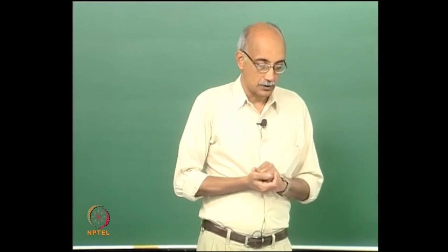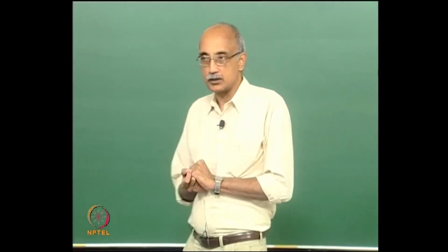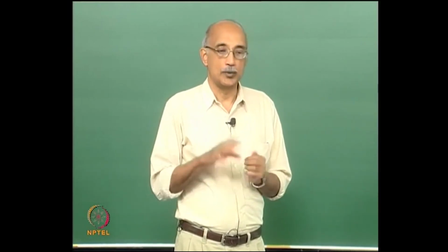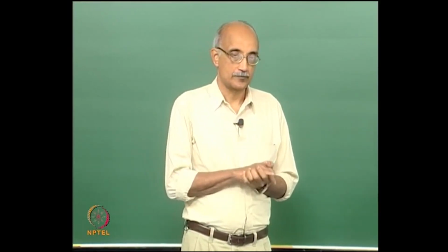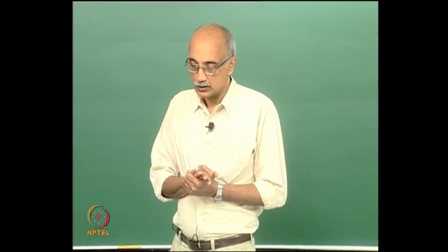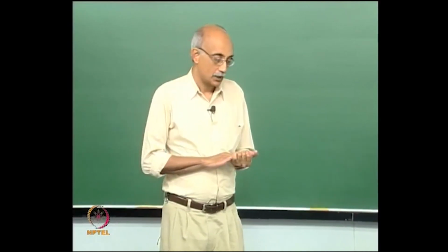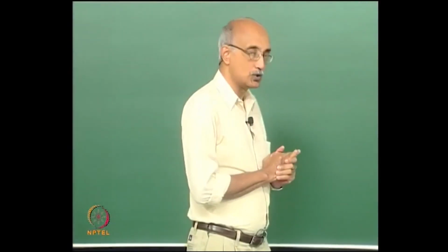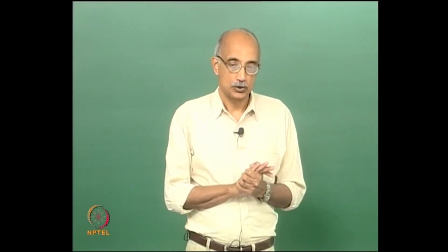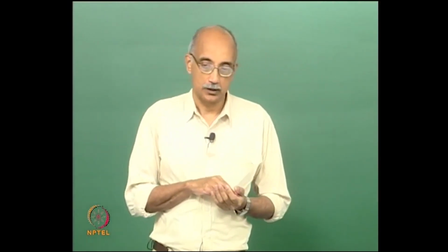And then we discussed static methods, and the first thing to realize is that in order to analyze particles in a static mode, you first have to capture them and immobilize them so that they can be inspected, and we discussed various techniques for doing this, including impactors, impingers, and filters, and so on. So, in this class we are going to assume that we have employed one of the methods that we talked about in the last class to fix a particle in its place, and now we want to characterize its size.